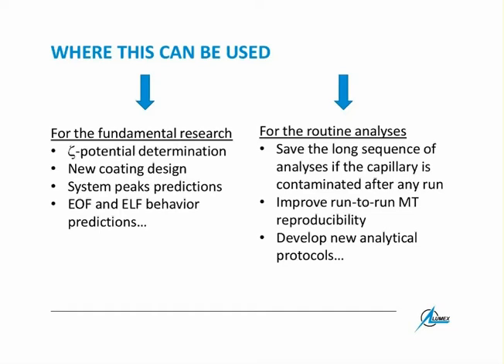And first of all, let me put your attention to this point. It's here on the right side of the slide. It saves the long sequence of analysis if the capillary is contaminated after any of the runs. Imagine you programmed a long sequence of analysis for about 20 samples, and you put this sequence on overnight, yeah?